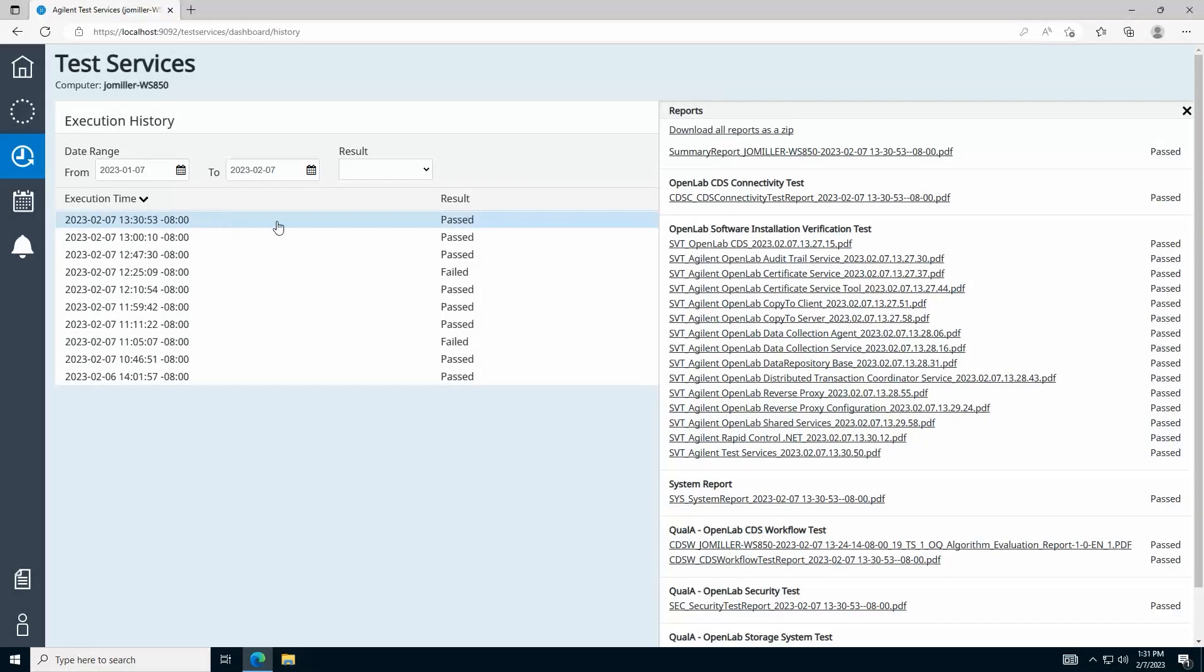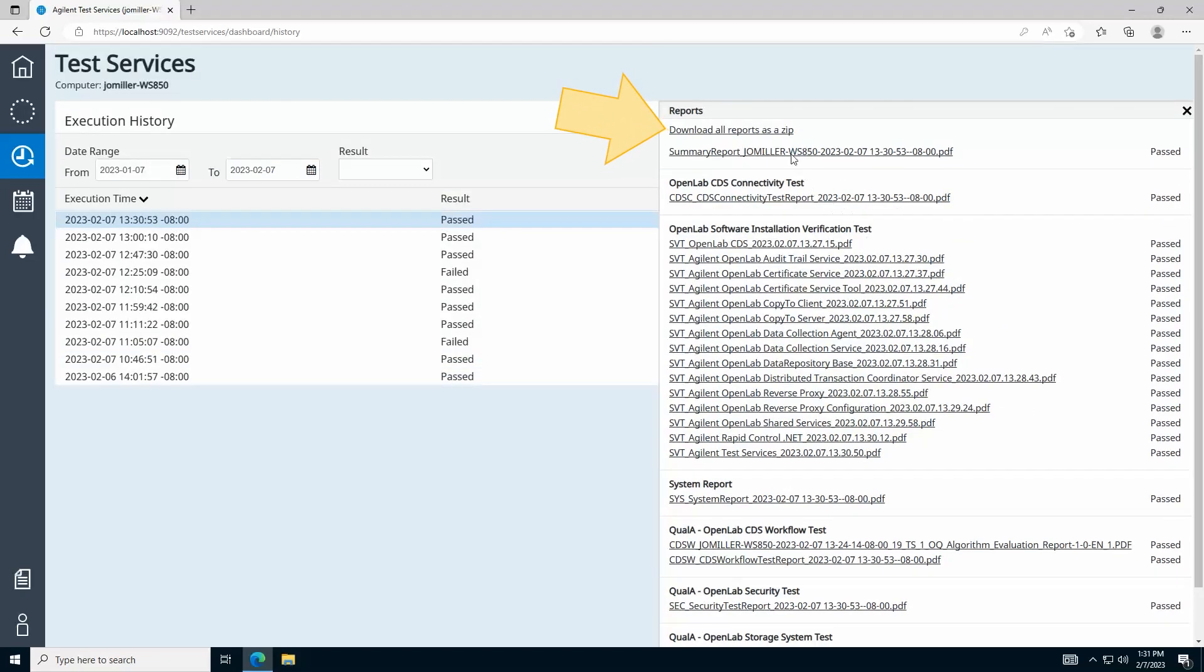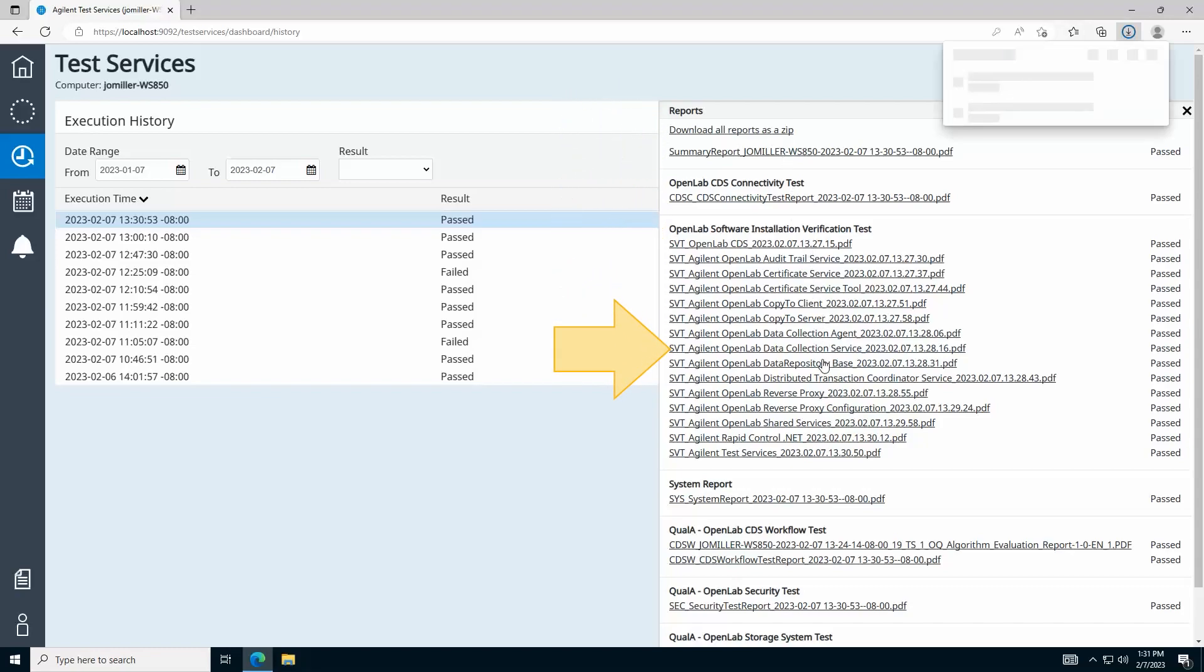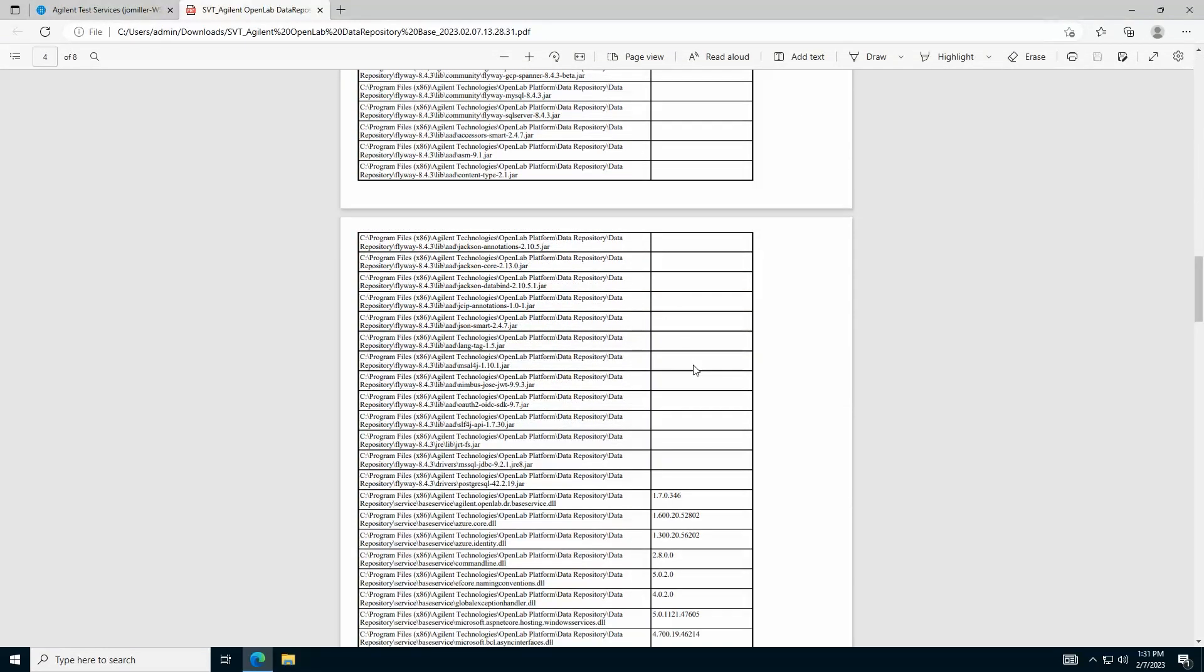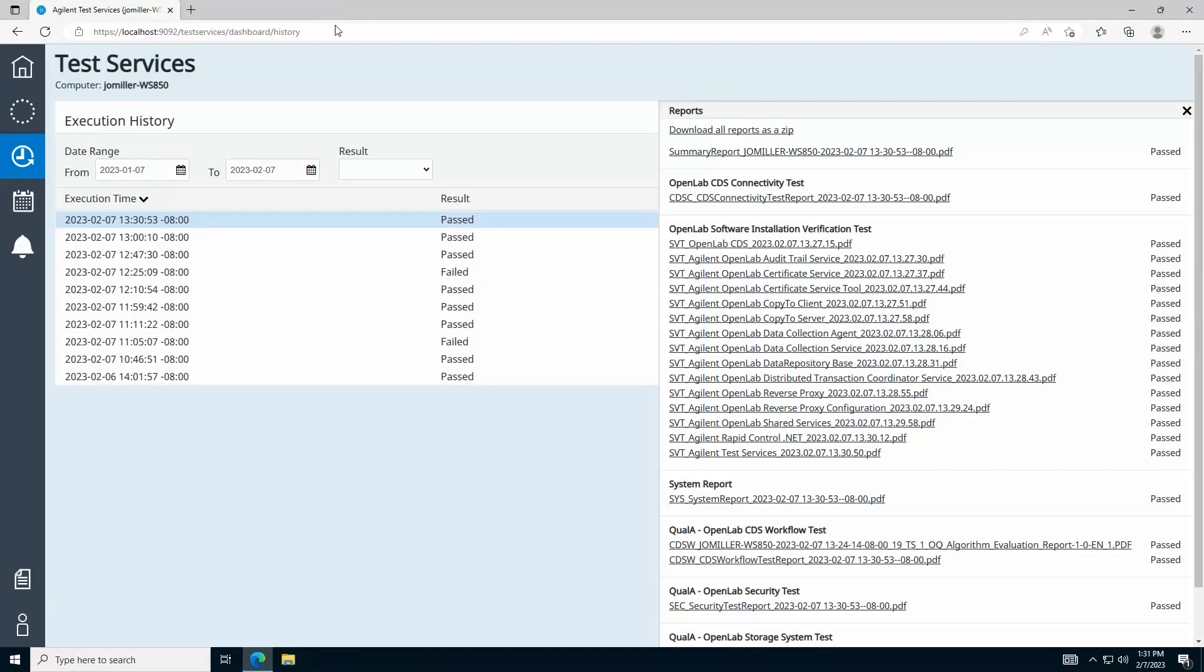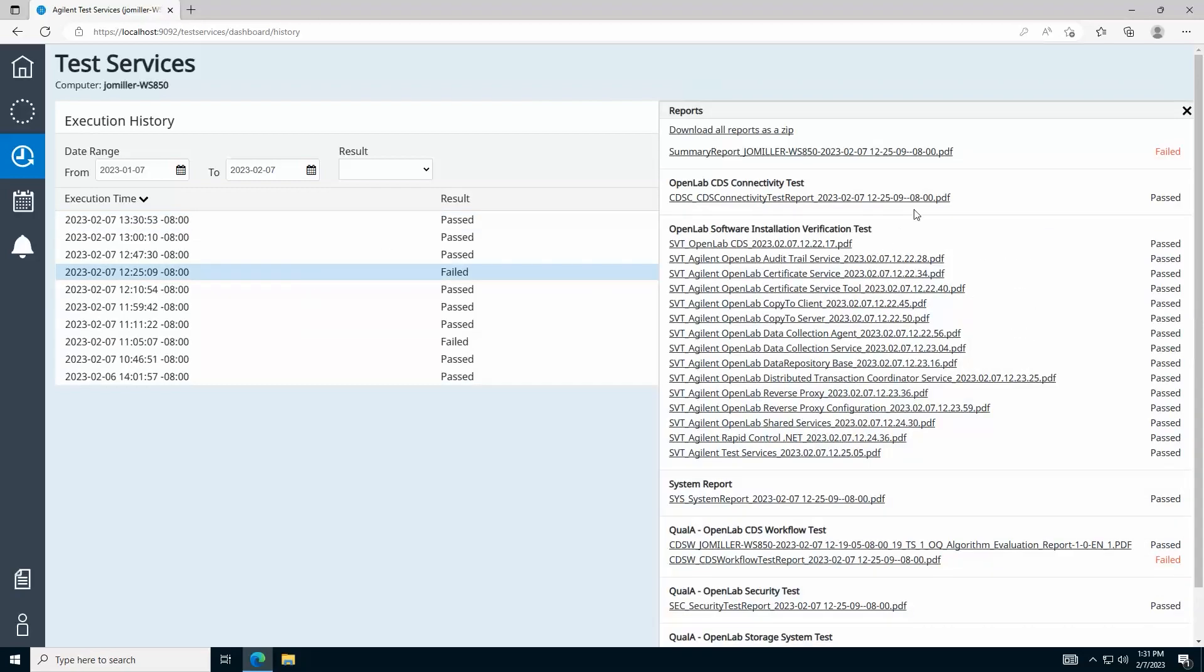Double-click any tests to open a list of reports that were generated by that test. Click the link at the top to download all the reports in this test as a zip file, or click to open any report. These reports can be used as one part of your overall validation documentation. Click the X in the upper right corner to close the test reports and select other results in your history.